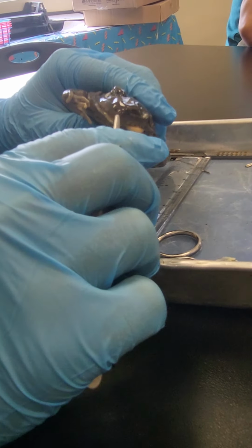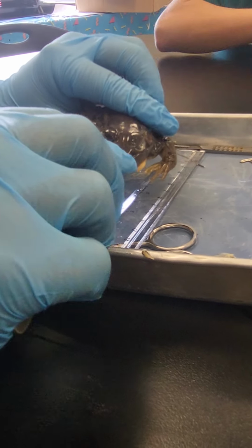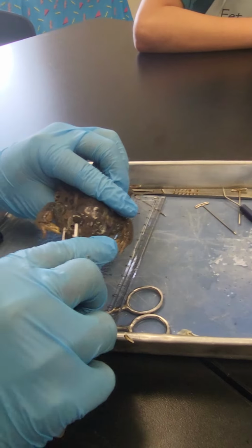Just stop. What's next? Just behind the eyes on the frog's head is a circular structure called the tympanic membrane. The tympanic membrane is used for hearing. Measure the diameter of the tympanic membrane. That's the little circle. Ollie, stop tearing its eye out.